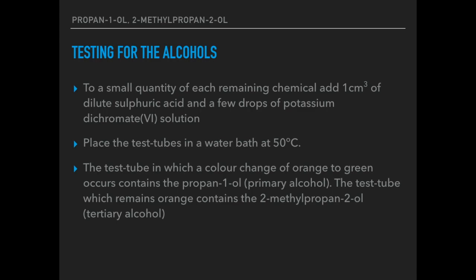The test tube which remains orange is the tertiary alcohol, 2-methylpropan-2-ol. The propan-1-ol has been oxidised to the aldehyde, because to produce the carboxylic acid you would need to reflux. Putting a test tube in a water bath at 50°C is not the same as refluxing, so it's very unlikely you would produce the carboxylic acid under these conditions.